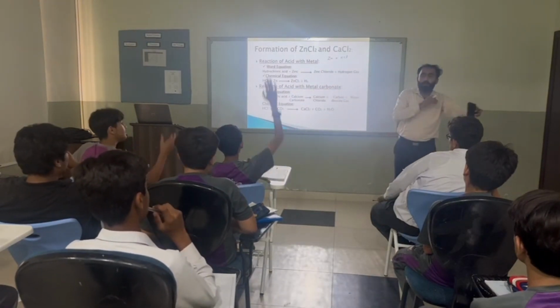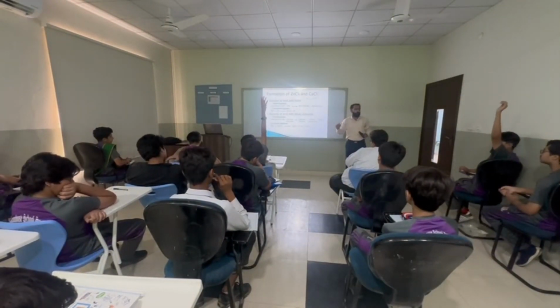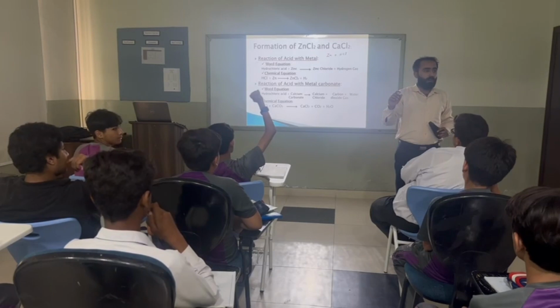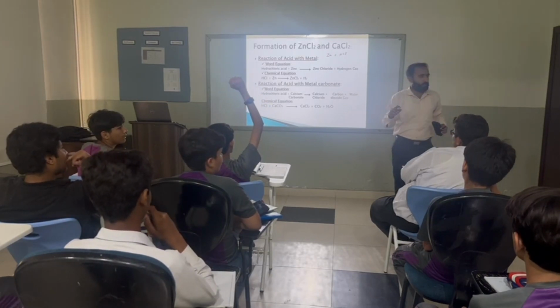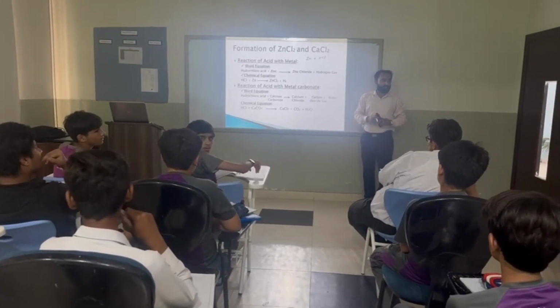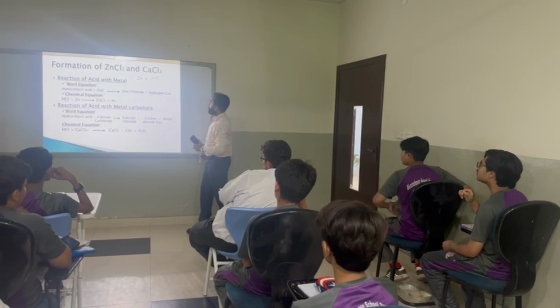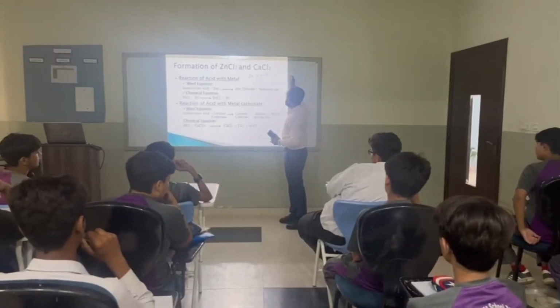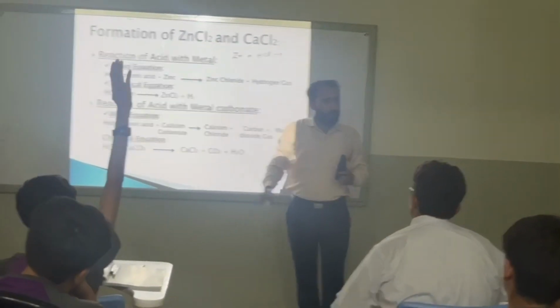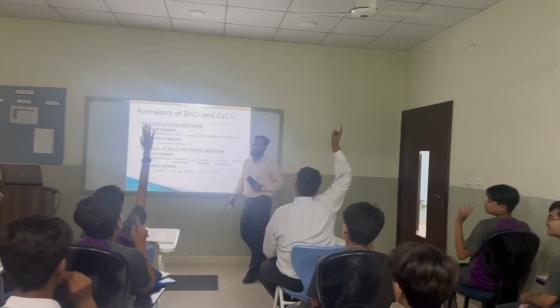So, what will be the product? Anyone of you? Other than you all, I would like to ask Mr. Abdul Al-Nabi. Please tell us, what would be the product of this reaction? Zinc chloride. That's great. Do you know the formula of zinc chloride? Sir, ZnCl2.